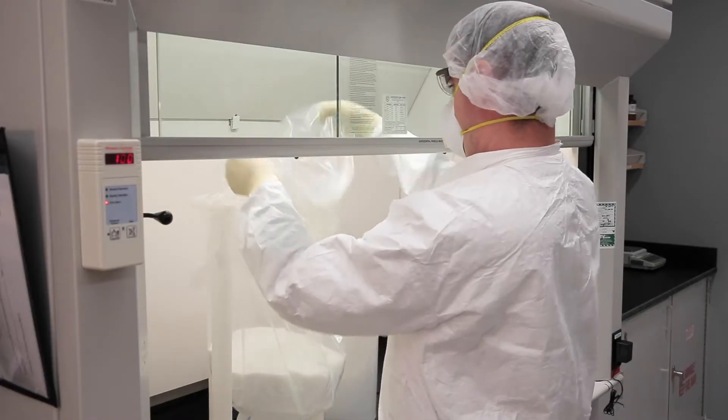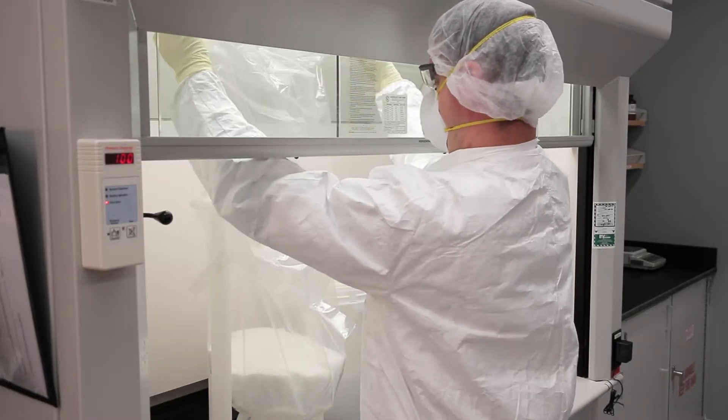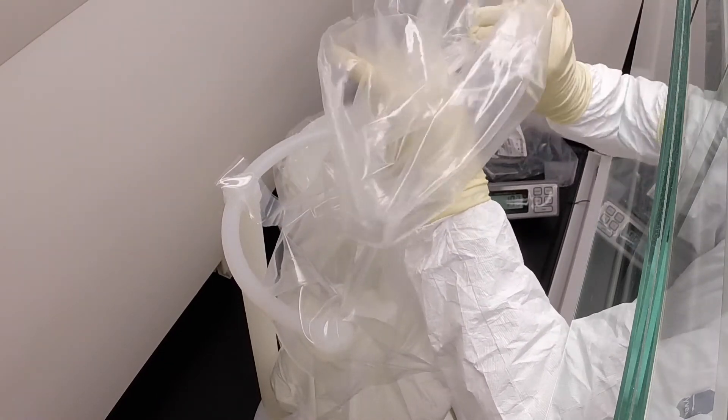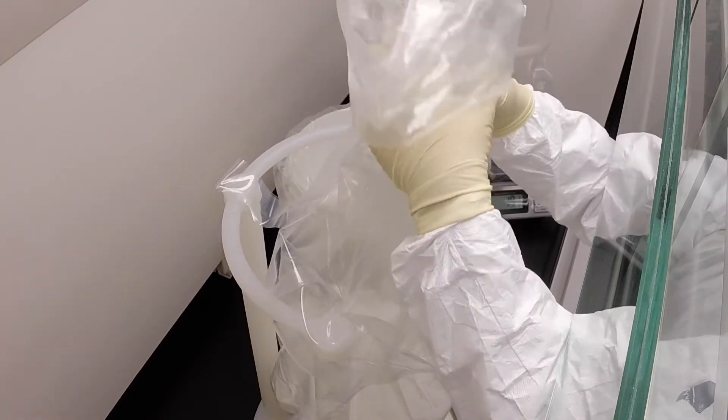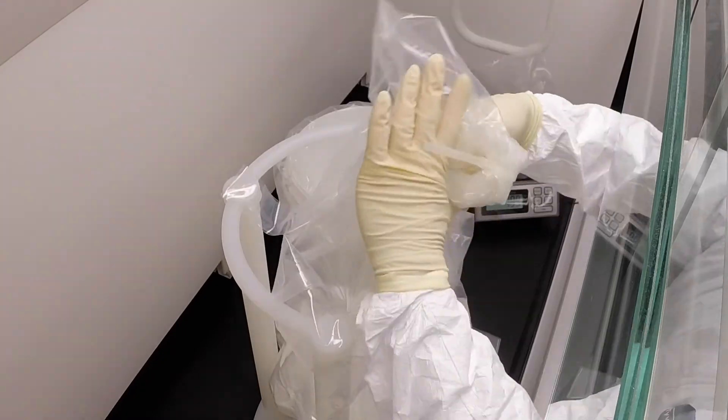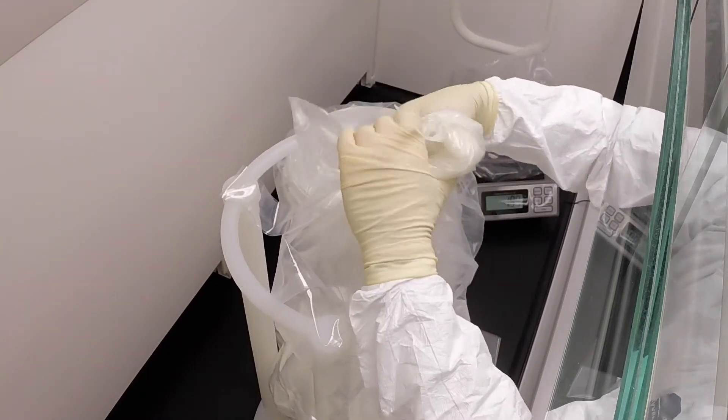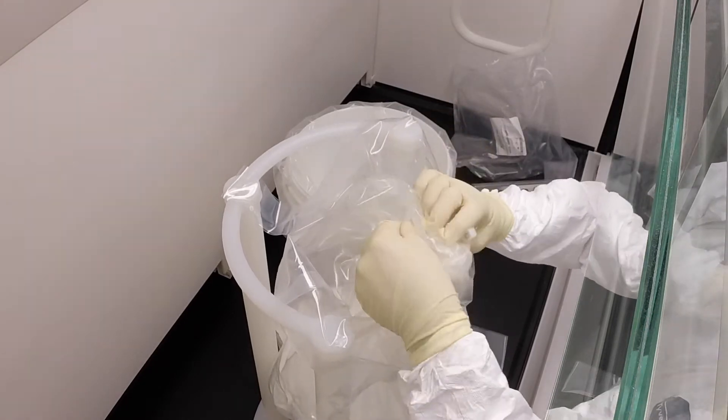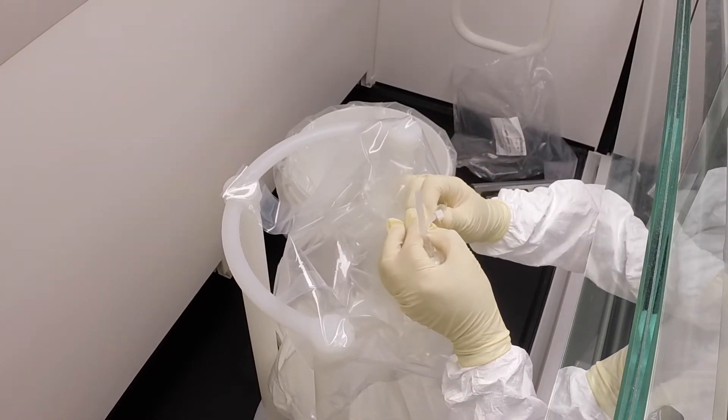Once filling is complete, the skirt is simply rolled back up and clamped shut, keeping any powder on its surface sealed inside. Wipe-down of the stand and bag exterior is eliminated. Sealing the bag is also easy using the attached zip ties. Now the bag is safely secured until time to discharge the powder into a processing vessel.